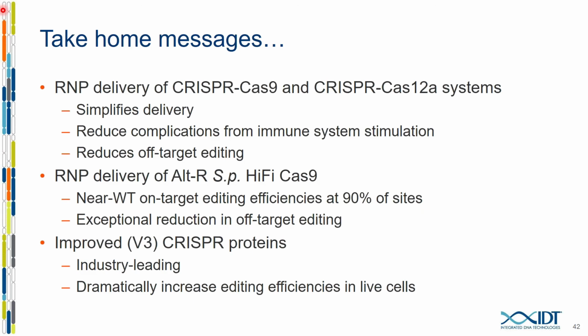Dale would like to know if IDT's HiFi Cas9 can tolerate a heterologous G at the beginning of the guide RNA.